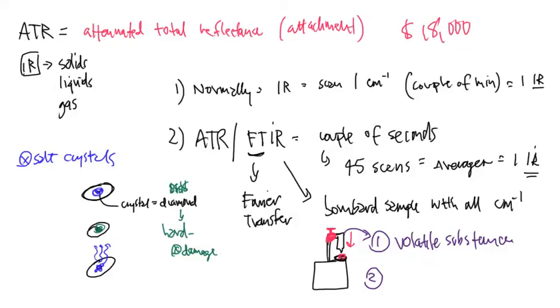And number two, it's not a have-to, but some people prefer it: if you use a solid, then you would lower the anchor down onto the solid with or without that cap on it, and this prevents it from basically blowing away. Kind of the similar concept of a liquid, but it's just a solid instead.